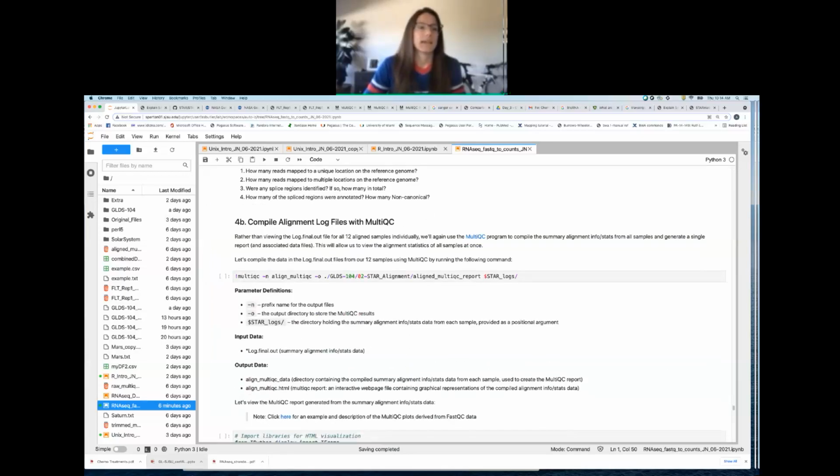The next thing that I want to do, and I'll ask you just a few questions about this, and then we should be able to get into the counts lecture before we head off to break. You guys remember using that multi-QC function to compile all of our quality control reports from the FastQ files?